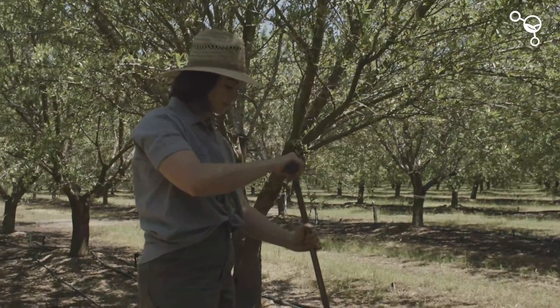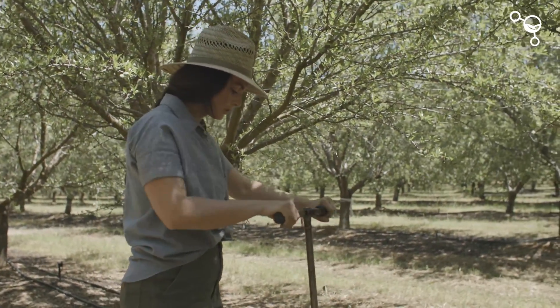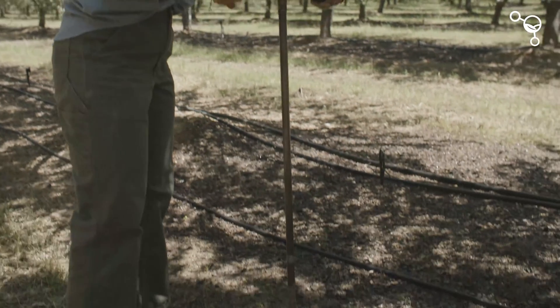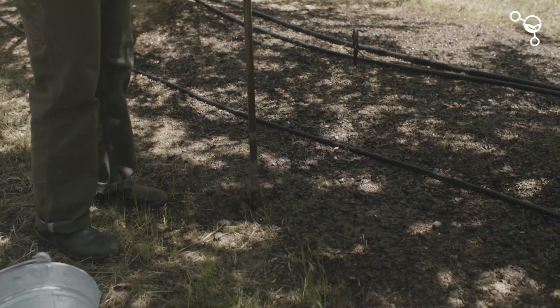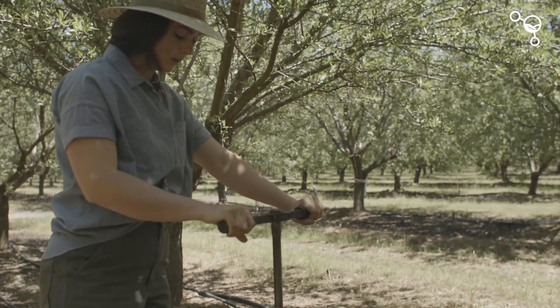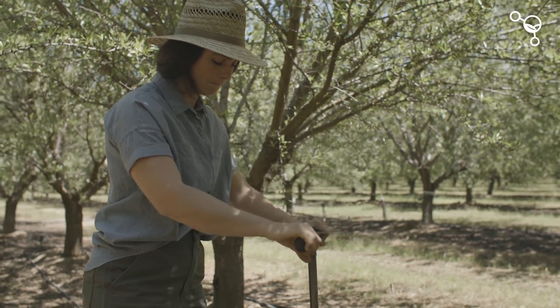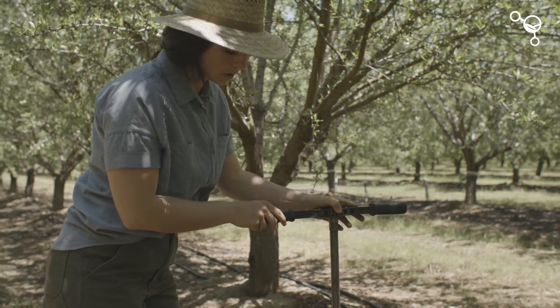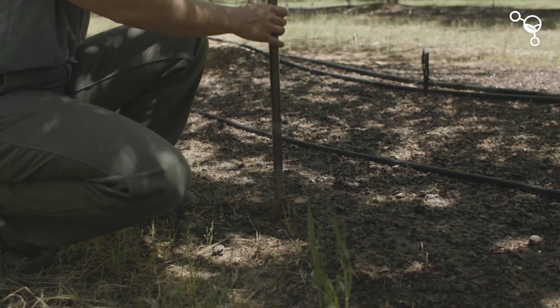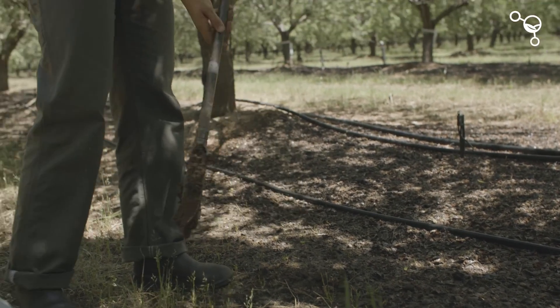This is our first core and we're going to take at least three of these cores to make one composite sample. We're going down about six inches — 10 to 15 centimeters — and we're collecting our first core here. We don't have too much debris on the top. We're going to pull this out, and here's our first core.